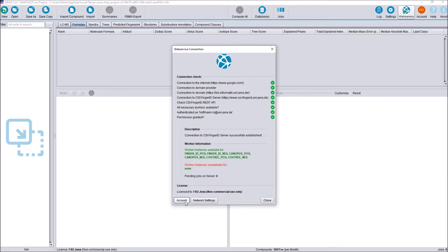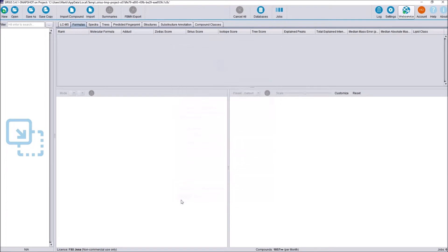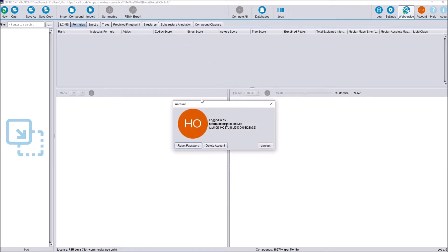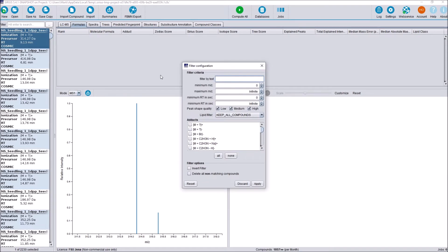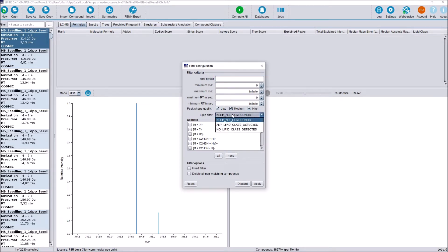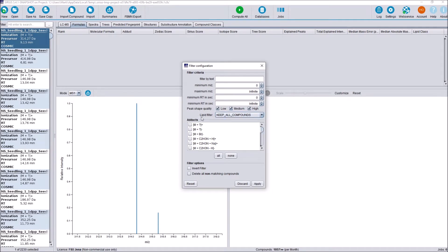We can then also go to account here again to check our account data, to reset our password or to delete our account. I now loaded in some demo data and the first thing we are going to explore is the new improved compound list filter. For that we go to the filter option here and we see that in particular what's new is the peak shape quality filter here and the lipid class filters. I am not going to go into the functional details right here, I think they are pretty self-explanatory. But I will explain a little bit more when we get to the underlying functionalities of peak shapes and lipids. We are also able to invert our filters or delete all non-matching compounds.